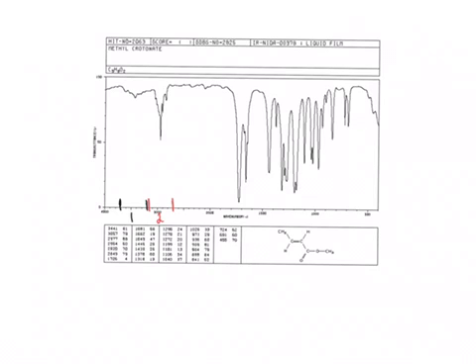Here we're going to look for alcohols and functional groups of that nature, and as we can see here, we don't have any significant dips in our wavelengths, so we're not going to have any alcohols in our structure. The second zone is from around 3200 to about 2700, and here I have highlighted in red and numbered it with red. We actually are going to see that we do have a significant dip here, so this is evidential of a carbon to hydrogen, sp3 bond here.